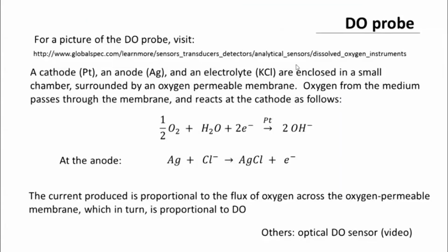In the lecture before that, we had looked at certain bioreactor environment variables that affect bioreactor performance, such as temperature, pH, medium composition, agitation, aeration levels, and dissolved oxygen levels. These are crucial, and so they need to be properly measured and controlled. We looked at some aspects of that. We looked at the dissolved oxygen aspect.